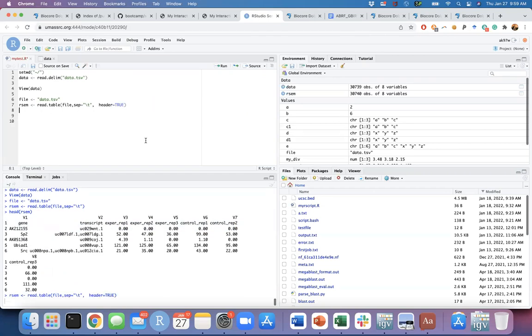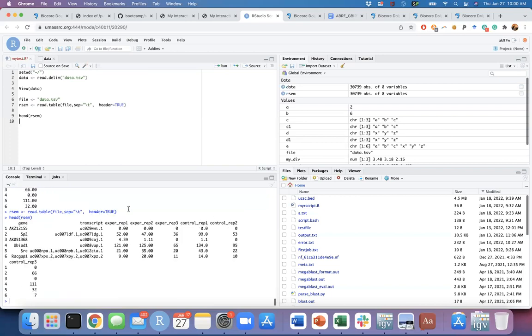Okay, when I do this, RSAM, there's this function too, by the way, head, like you have in Linux, in Bash. It's similar, but you are using it a different way. In this case, you are using the functions in R, totally different than Linux. You're just using head with parentheses like this. See, it's just putting six rows in that table. Now you have them here, 6 rows.